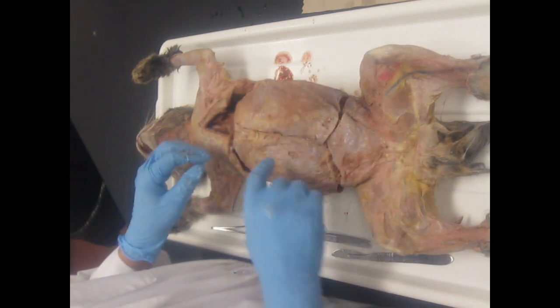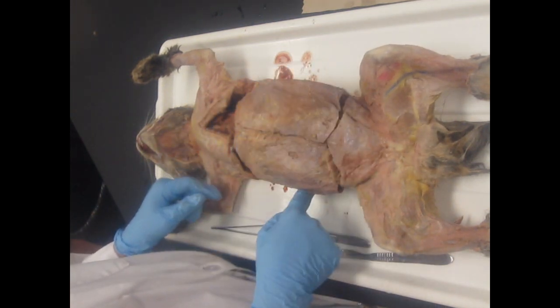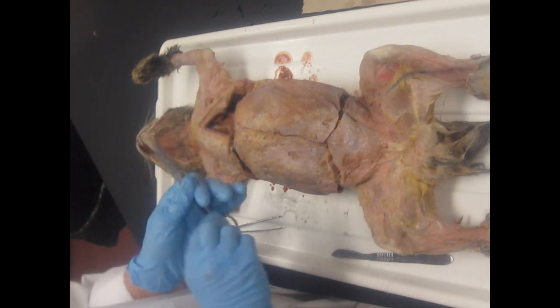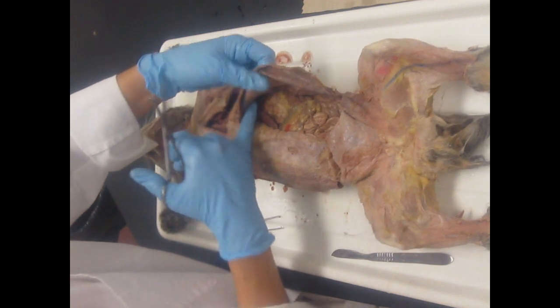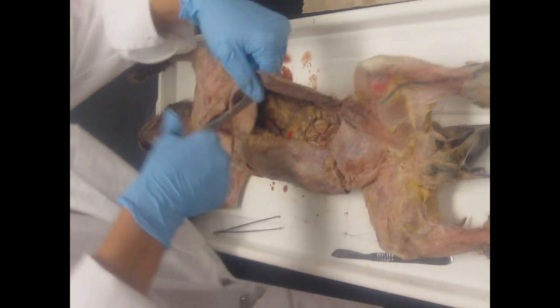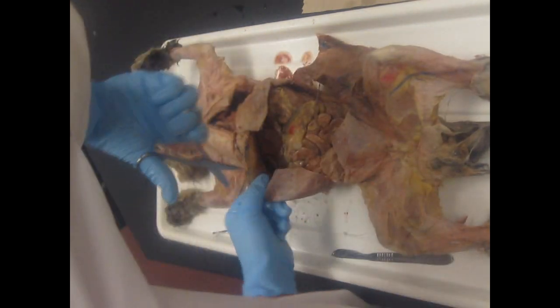Walls want to stay closed. You're going to go below the diaphragm and make the same incision down as you did above the diaphragm. Careful not to cut the diaphragm off. So I just look up under there and say, okay, there's my diaphragm. And I make my lateral incision. Walls are open.